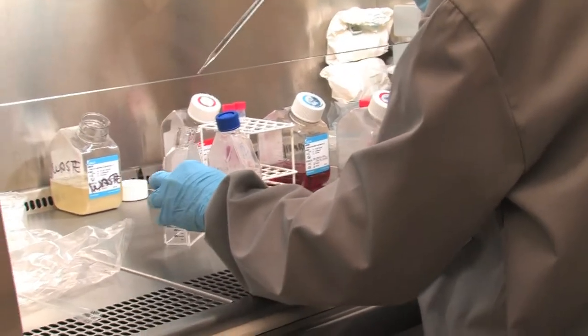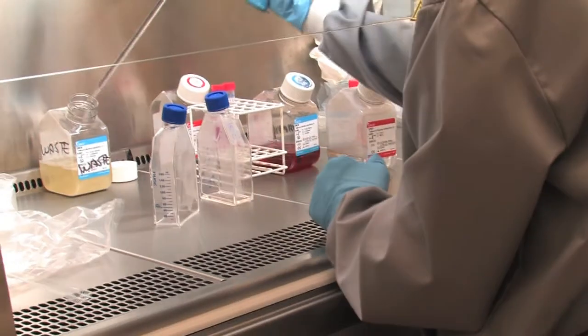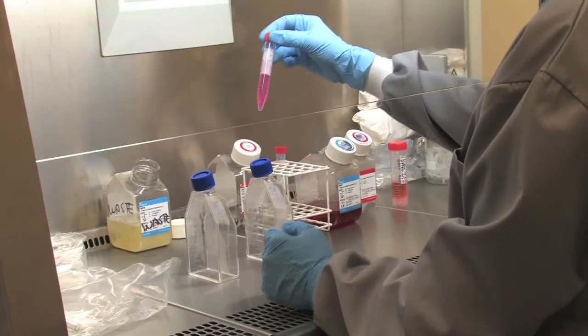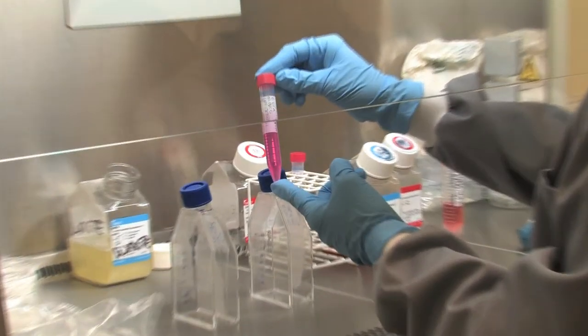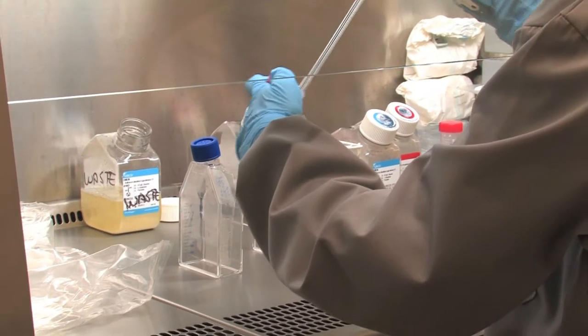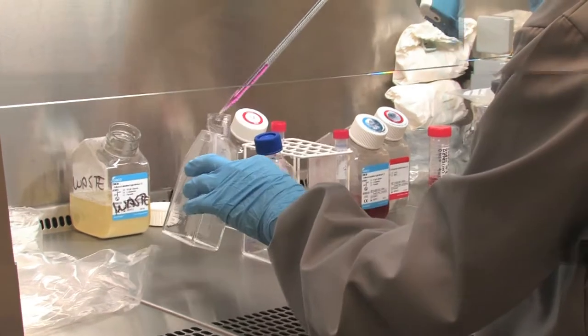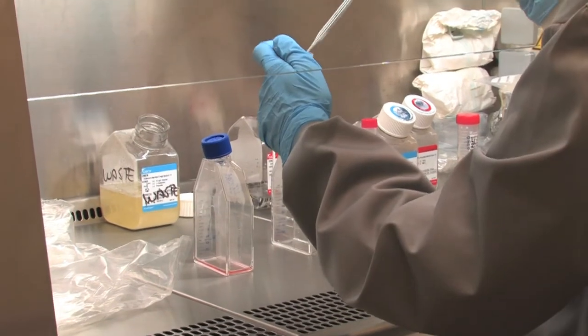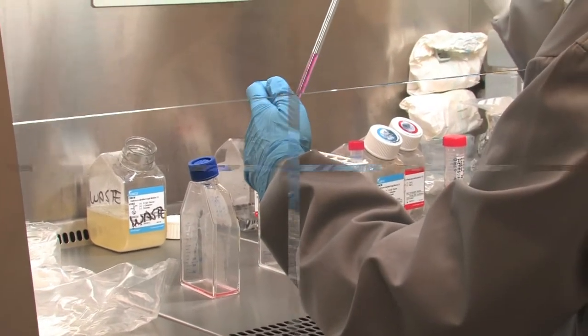Special care should be taken not to disturb the cell layer at the bottom. The next step is to trypsinise the cells. Approximately 2ml per 25cm² culture surface area of pre-warmed trypsin is placed in each flask in order to detach the cell layer from the bottom of the cell culture flask.